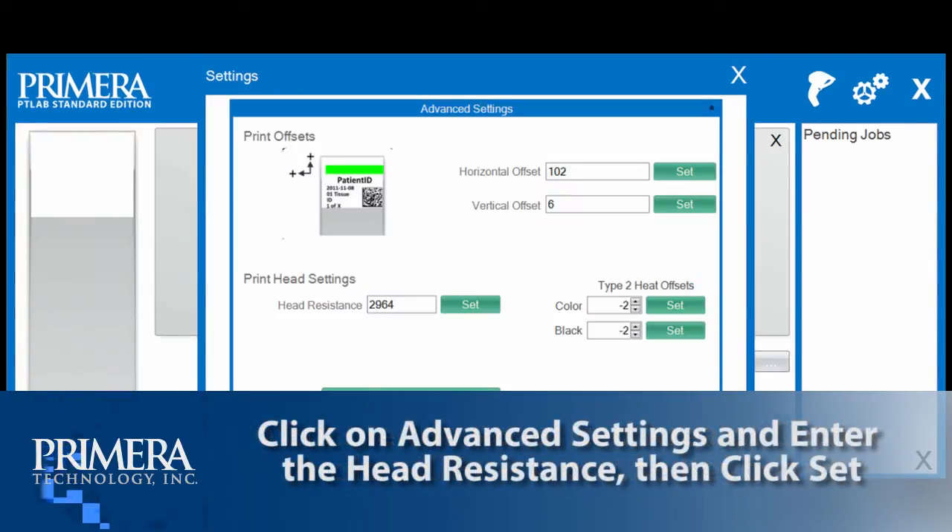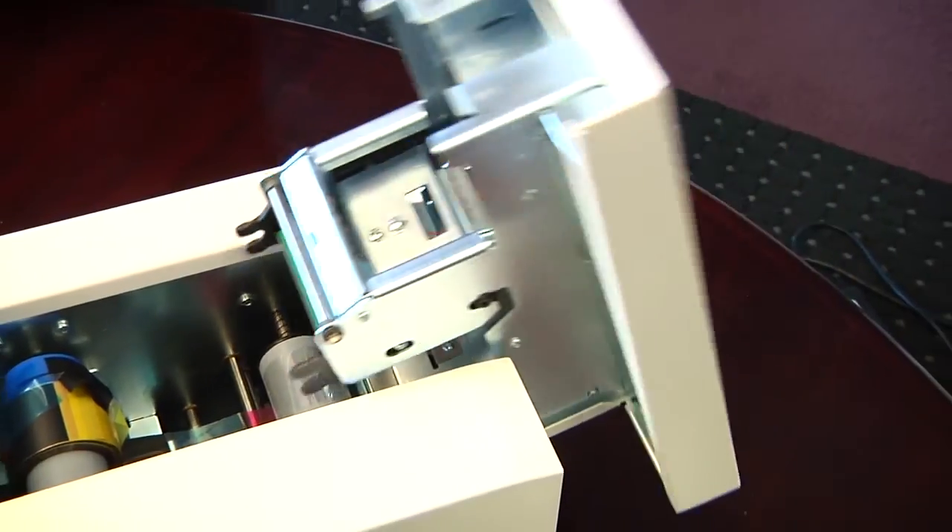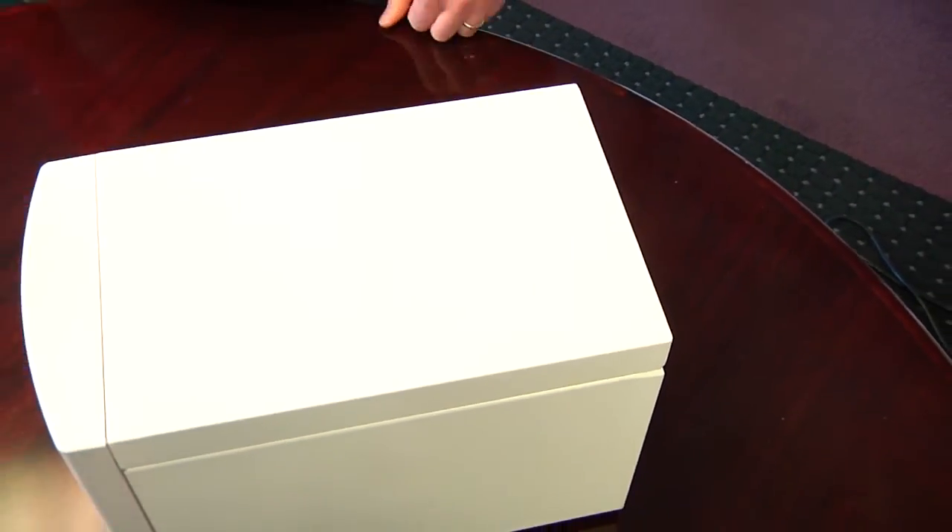Now click on advanced settings. Enter the head resistance, then click set. Your Primera signature slide printer is now ready to print.